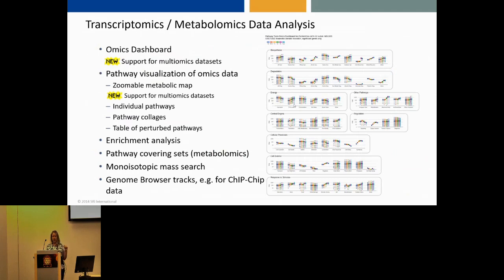We have a whole suite of tools for omics analysis and visualization, and I'm going to go into some of these in a bit more detail. This is an example of our top-level view for our omics dashboard. Don't worry about it, you can't read it. I'm going to describe it a bit more shortly.